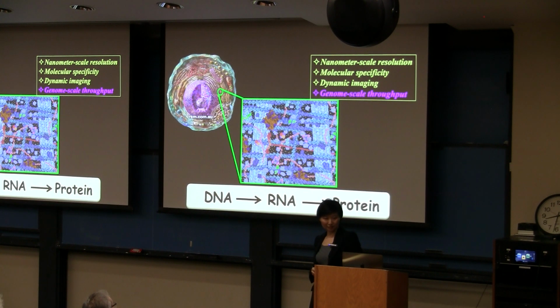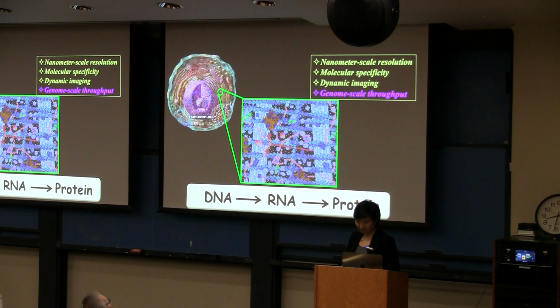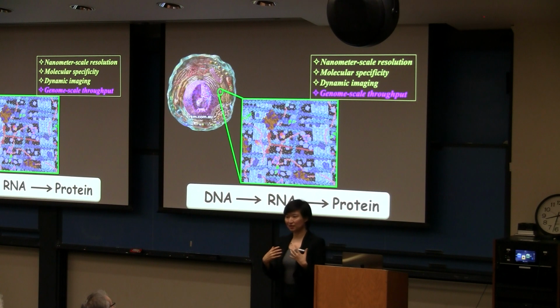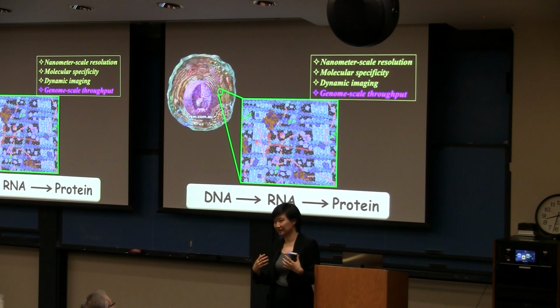Technologically, you'll see right away because the labeling is relatively easy. Biologically, the way to think about it is, inside our body, we have many, many cells. These cells, there are many, many different kinds. And these different kinds of cells are not because they have different genomes. They by and large share similar and often identical genomes.